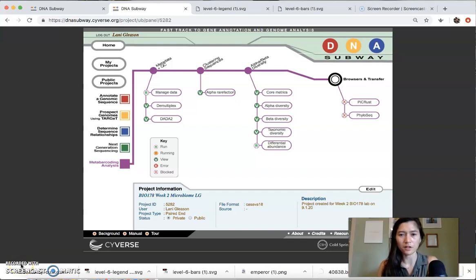All right, we're in the home stretch here, and now we're getting to look at some of the really interesting data. This is where we'll actually get some answers to our original research question, which was whether the bacterial communities are different in male and female garter snakes.